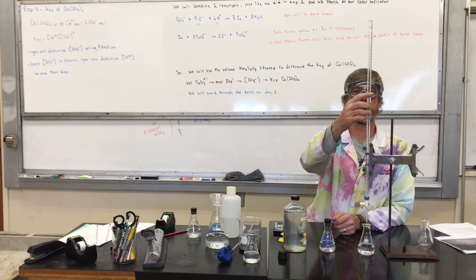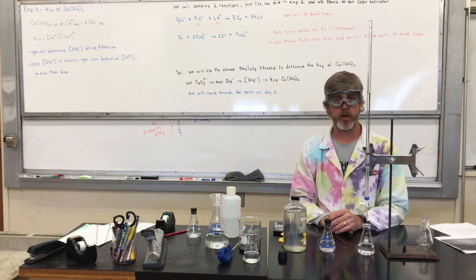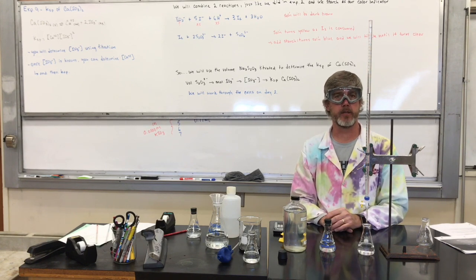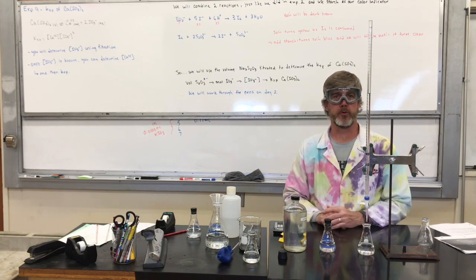So I'm going to read my burette volume. I'm going to do 2 more trials, and then we'll come up, wrap up, share the data that you're all going to use for your calculations, and go through some of those calculations.